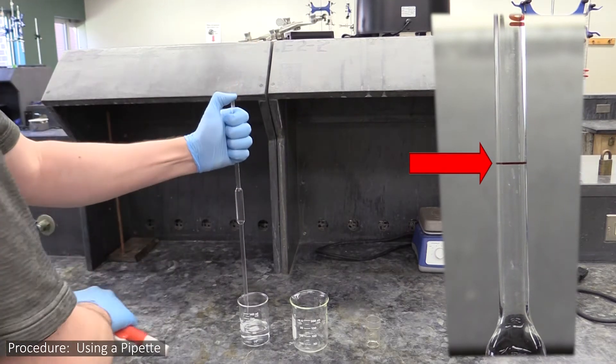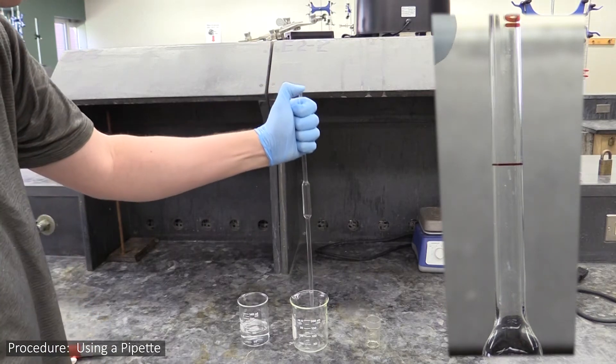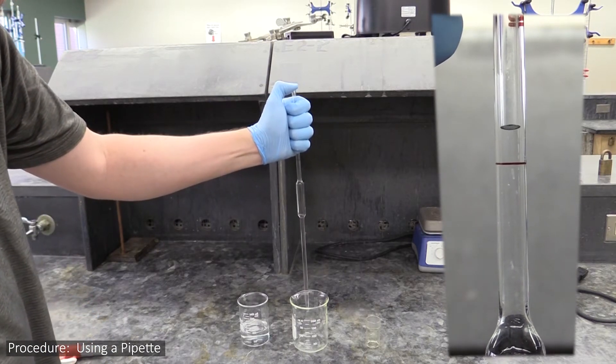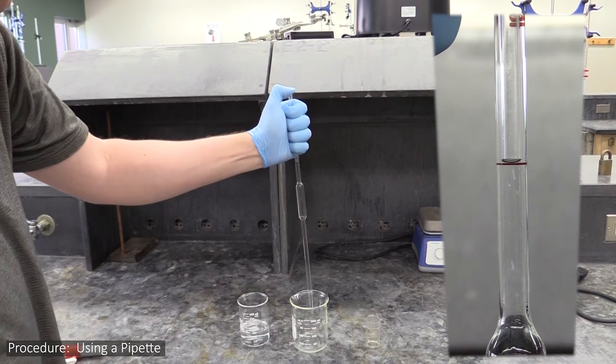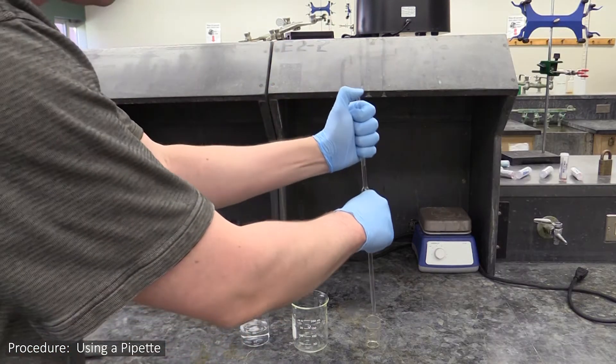Then take the pump off and use your thumb or finger to hold the liquid up. While it's over a waste container, let it drain down to the line. Then let it gravity drain into the bottle.